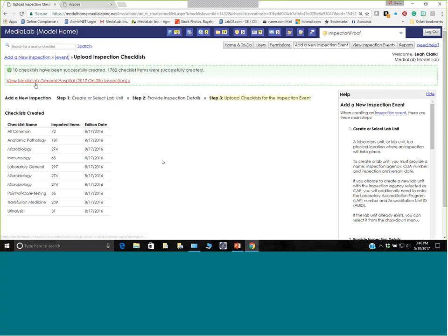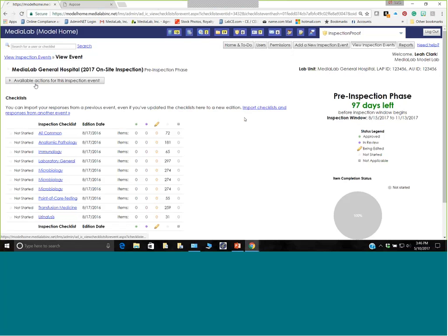We're going to view that event that we just made. And this is what it looks like. Okay, this is our pre-inspection phase homepage for this event. I've got a little countdown here. I have 97 days left. You can see my inspection window.